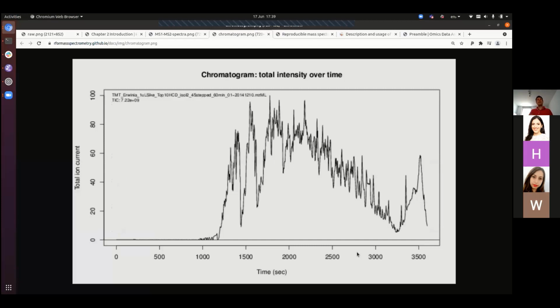On the other hand, if you have many, many samples to process, then you can't always wait for 2 hours until you acquire the data for one sample. Then you might want to have shorter columns and a higher flow rate to be able to acquire your data more quickly. So that will very much depend on the complexity of your sample.